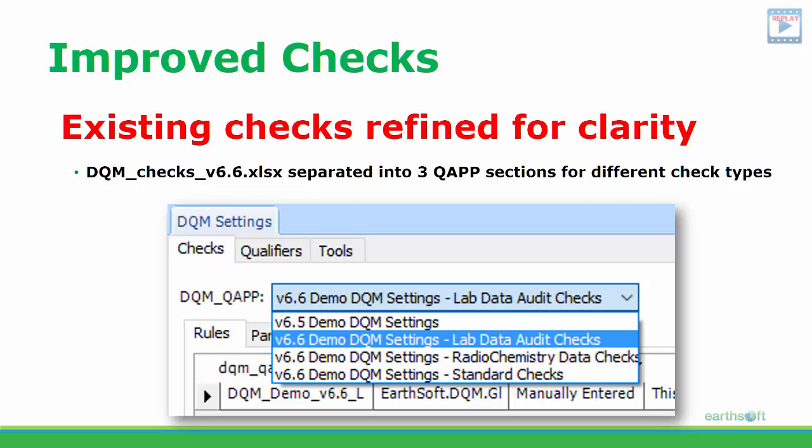I can see that's an interesting idea, like a level 1+, basically. Right, exactly. And that way you can tell immediately, okay, your blank was high, so that's going to screw us up completely when it comes time for doing the full-blown validation. That kind of stuff.